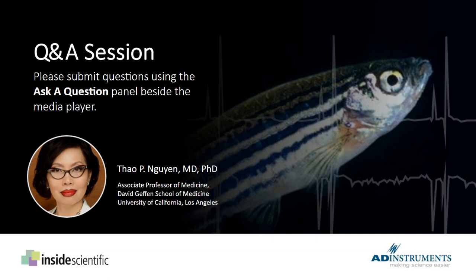Okay, that's great. And we've got another question here. Have you ever tried to record ECG on zebrafish larvae? Nope. Let's not push the limits. But no, we work with adult zebrafish only. There are people who do that, though. There are scientists who actually record electrical activity from larvae. It was published.